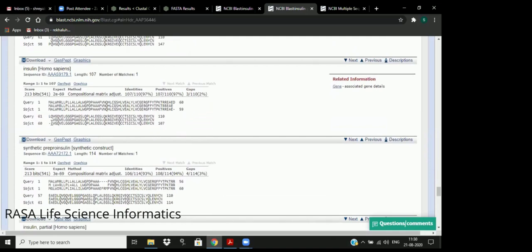This means that I will not get anything in reference to DLQ. For DLQ we have gaps, right? Which means that I won't be able to predict anything for that. Although this is a very small part, okay? These gaps are something which does not bother much, okay? But if this gap increases, then that is bad.